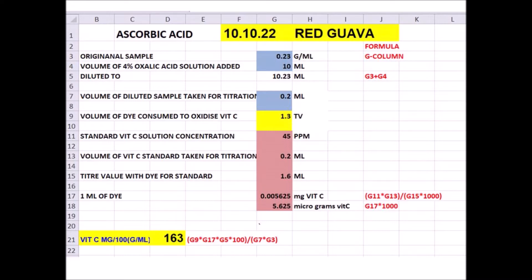The volume of diluted sample taken for titration goes in G7. After extraction we got the solution and from that we take only 0.2 ml. Taking a very small sample gives accurate values — the color change will be very clear and we can add a smaller amount of oxalic acid, only 2.5 ml, making the endpoint easy to see. So we take a very small sample and add only 2.5 ml of 4% oxalic acid before titrating with the dye.